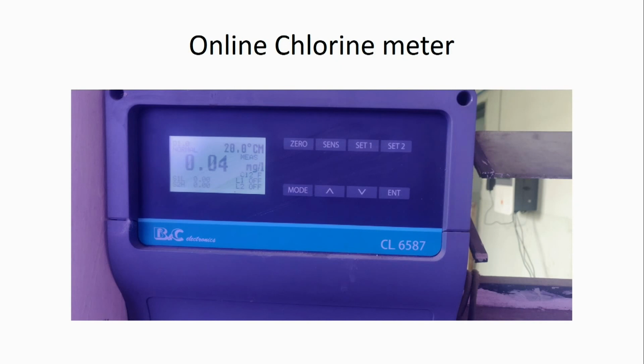All that happens is that the valve which normally takes the product water will close, a drain valve will open and the polarity will be reversed. That will drain all the water rich in ions down to the drain. So you can program it for a fixed period of time. Electrodeionizers are costly. They cost about 3 lakhs.